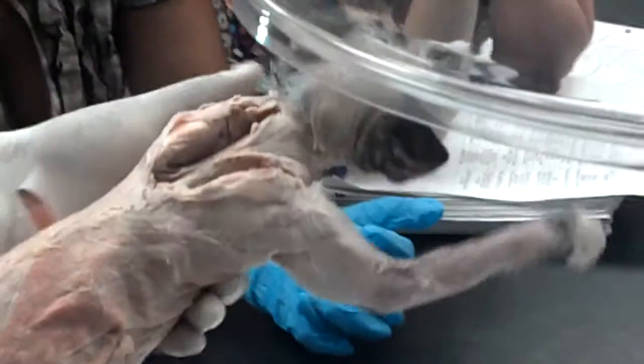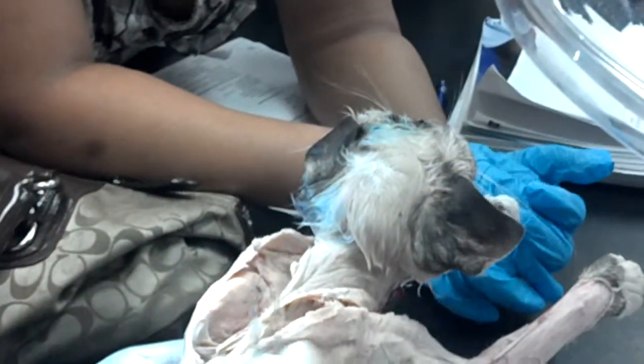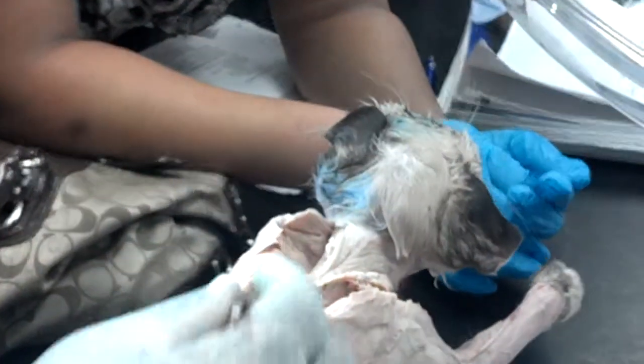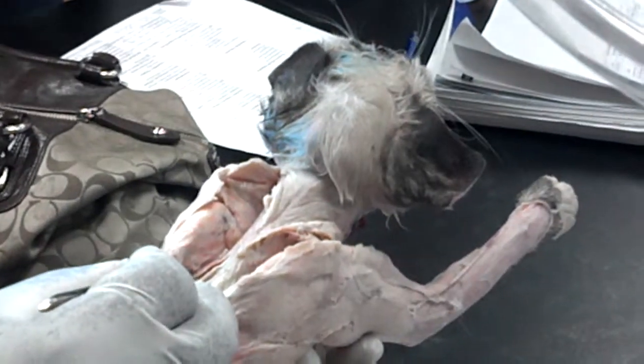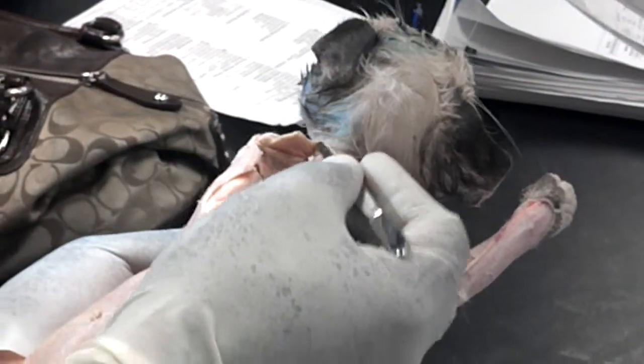I will flip this now. Deep here, on the inner side of the scapula, you have the subscapularis covering the inner side of scapula. Then you have the rhomboideus group, and you have this branch of rhomboideus group going to the head.